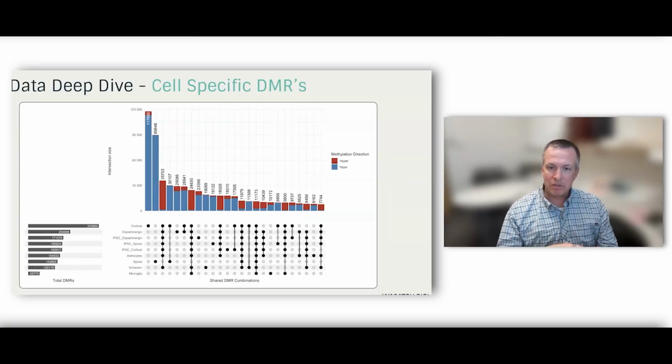And we assessed multiple different cell types to ultimately construct models which we could use as predictive tools for the fraction of cell-free DNA that's coming from different types of neurons. So this figure has a lot of information in it, but effectively, on this first bar, we're looking at cortical neuron DNA methylation profiles versus pretty much everything else. And so you can see the total amount of sites that discriminate just cortical neurons or just spinal motor neurons. And I'll skip over here. We can also see just dopaminergic neurons.